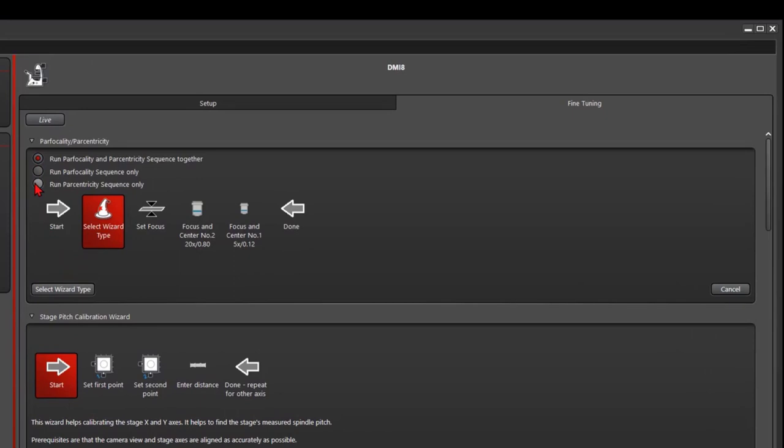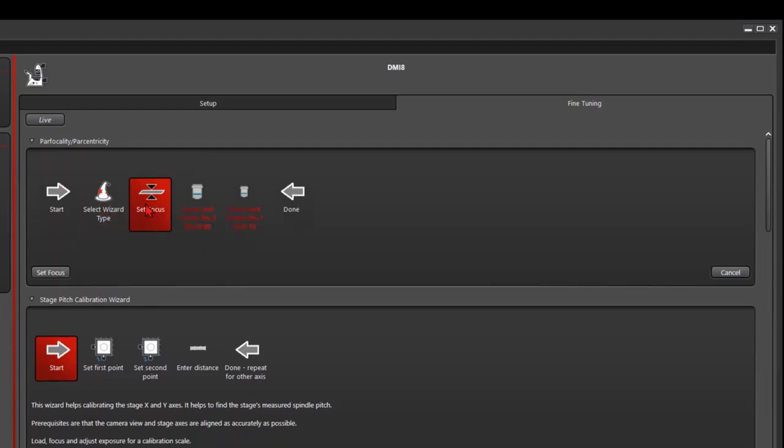If you have a motorized stage, we usually do pathfocality and pathcentricity at the same time. If you don't have a motorized stage, you cannot run the pathcentricity. Click select wizard type, select focus.